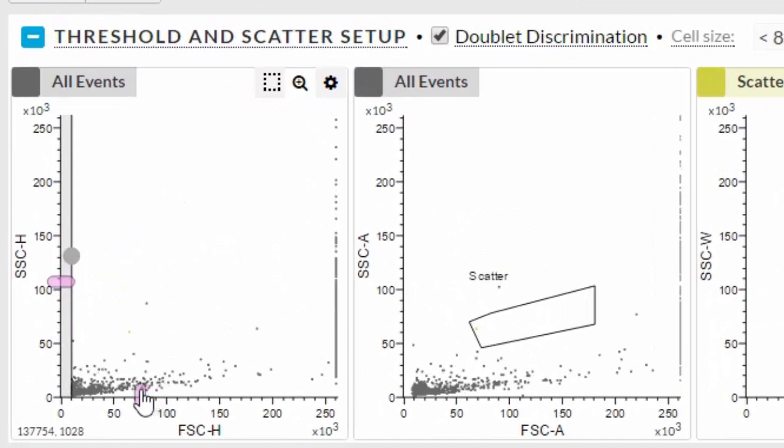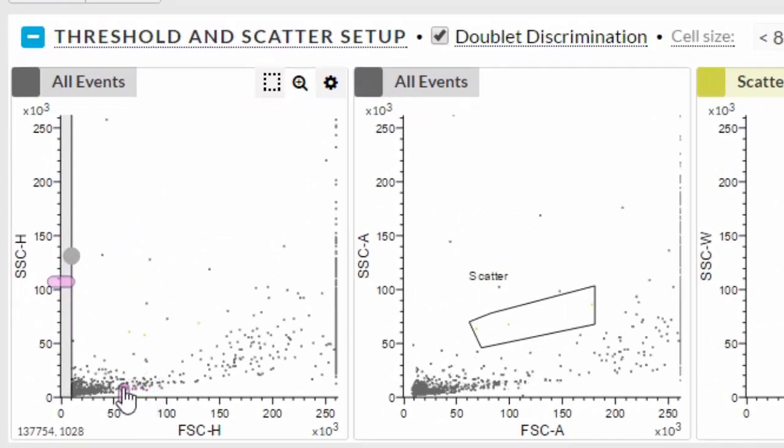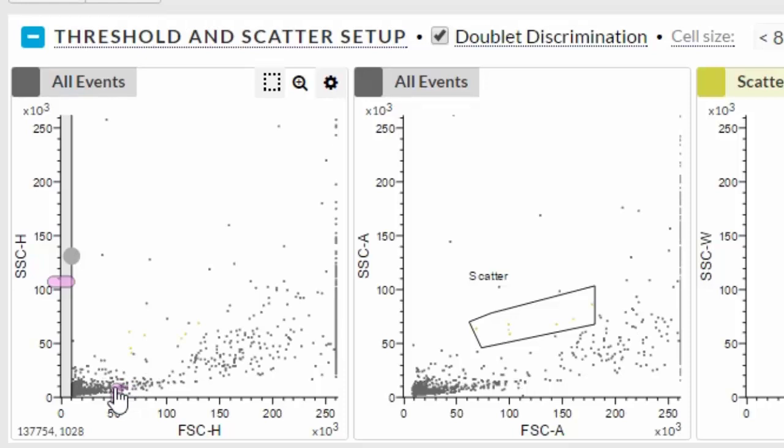In this example, let's lower the forward scatter voltage to place the cells of interest on scale. Make other adjustments as needed.